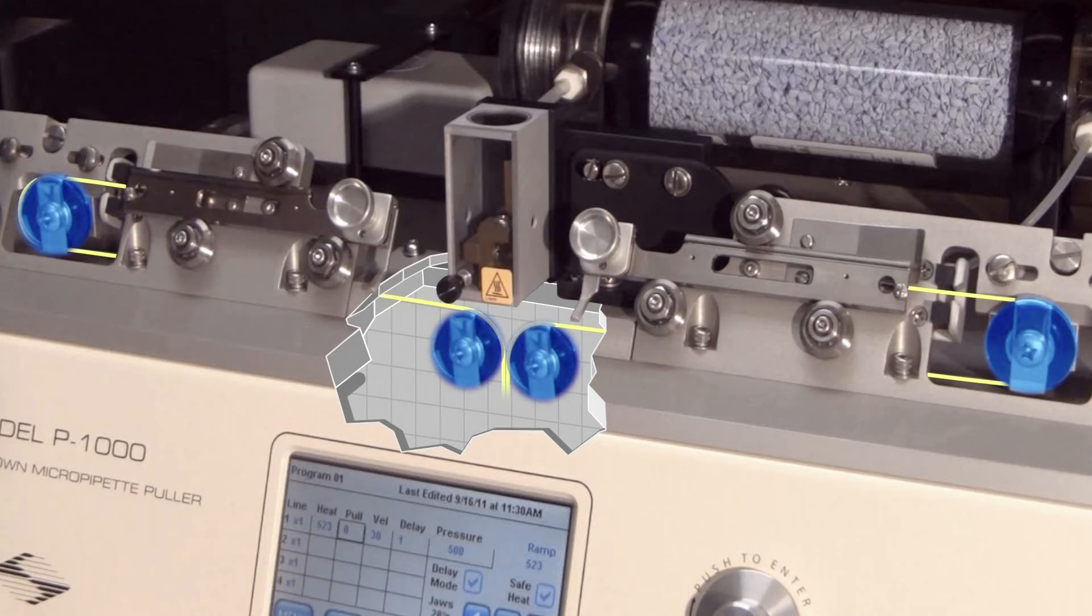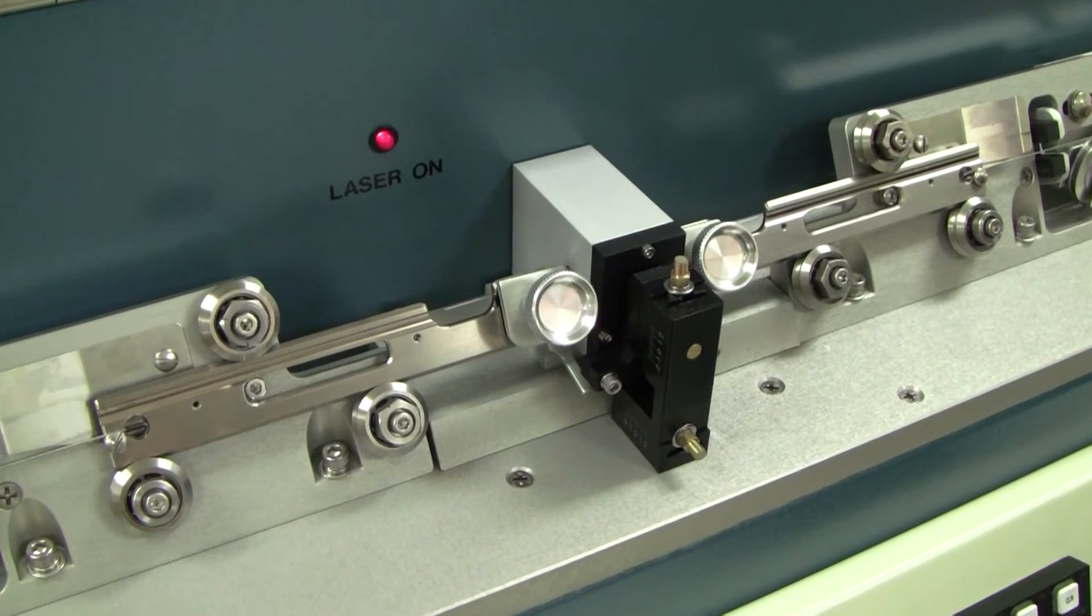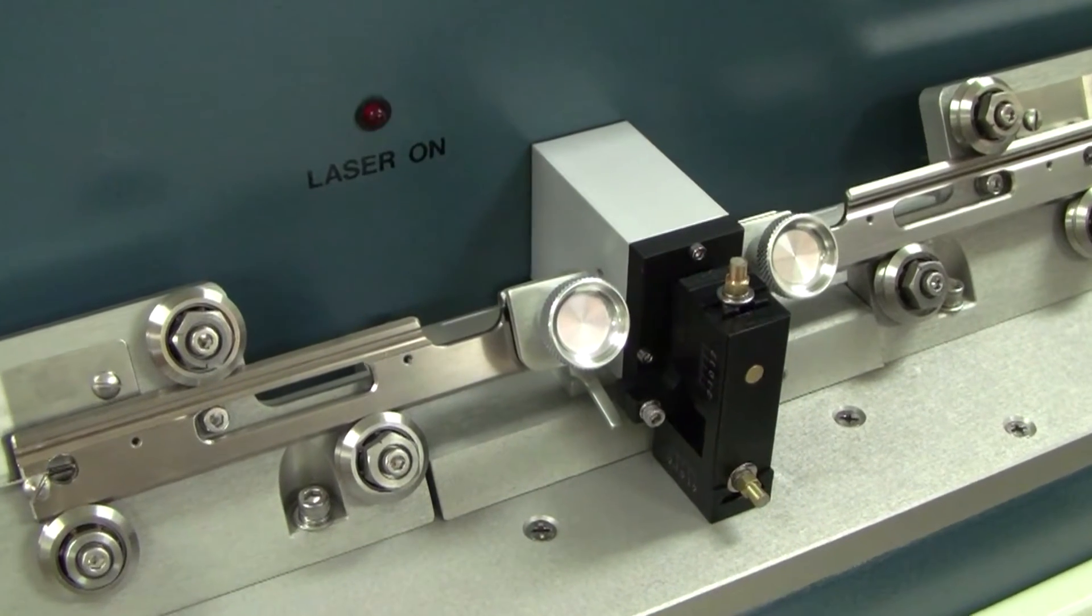The pulleys guide the pull cable and route it to the lower pulley assembly. Their smooth operation is crucial for the uniform movement of the puller bars and reproducible pull results.